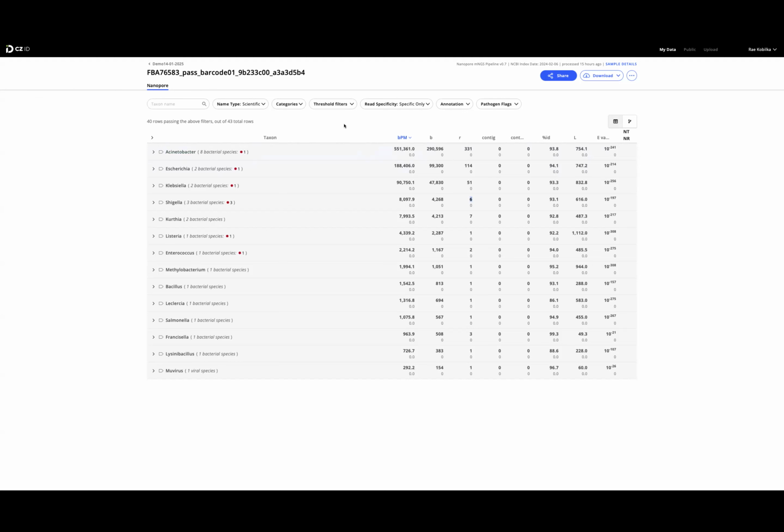So it's always highly dependent on the sample you've got, what is realistic that might be in there, because sometimes you find things in your analysis which just can't be true or are not relevant in your case. So you don't consider that as relevant here. But it's still depending on your analysis.